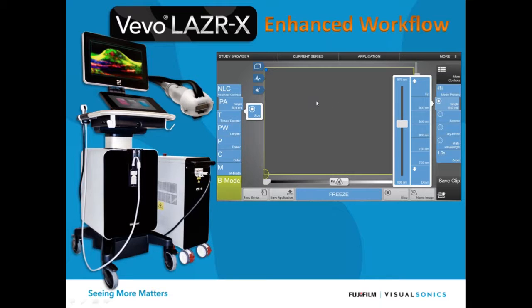So first, for enhanced workflow, those of you who already have and are using a 3100 will recognize this touchscreen interface. That's not the screen up there with the image on it. That is the clinical display where you see your image, and down here is the touchscreen. So that's a new control panel, and it's completely customizable. We can drag and drop different buttons, different functions we use more often for certain applications, and make them more prominent on the panel. Because it's touchscreen, that really opens it up for making it quite customizable.